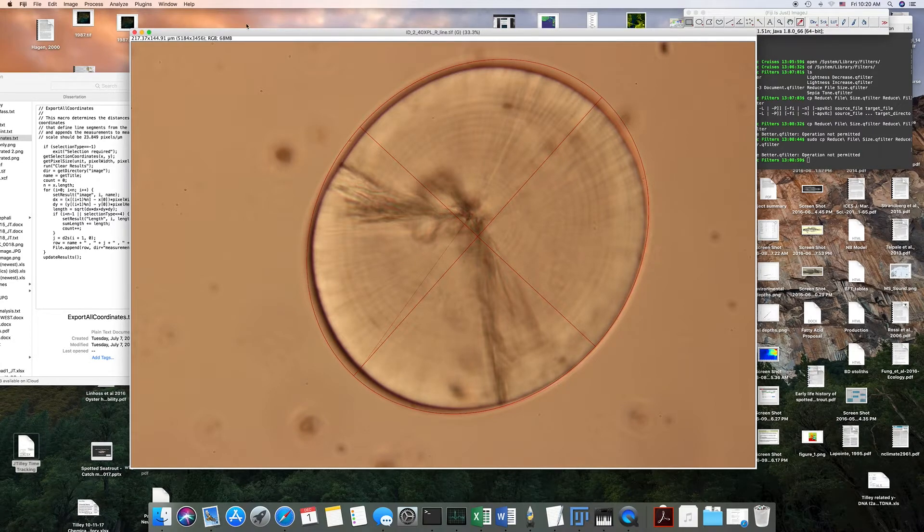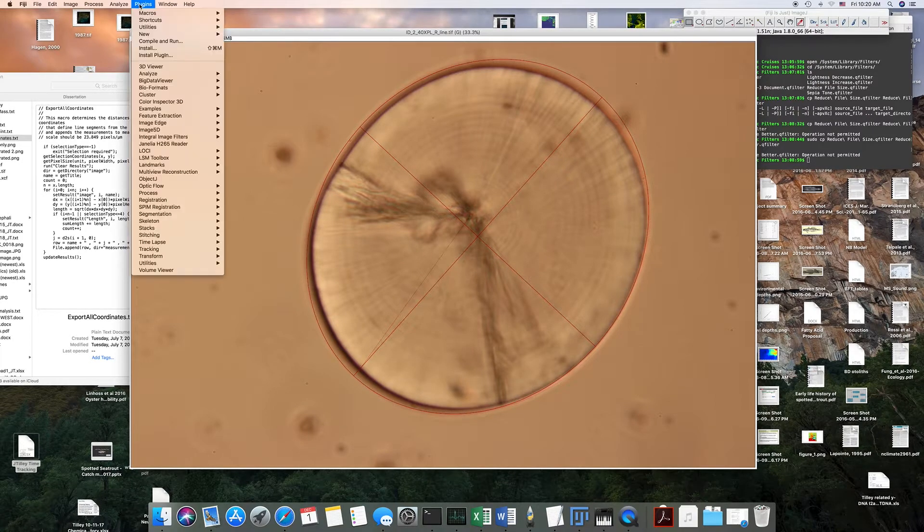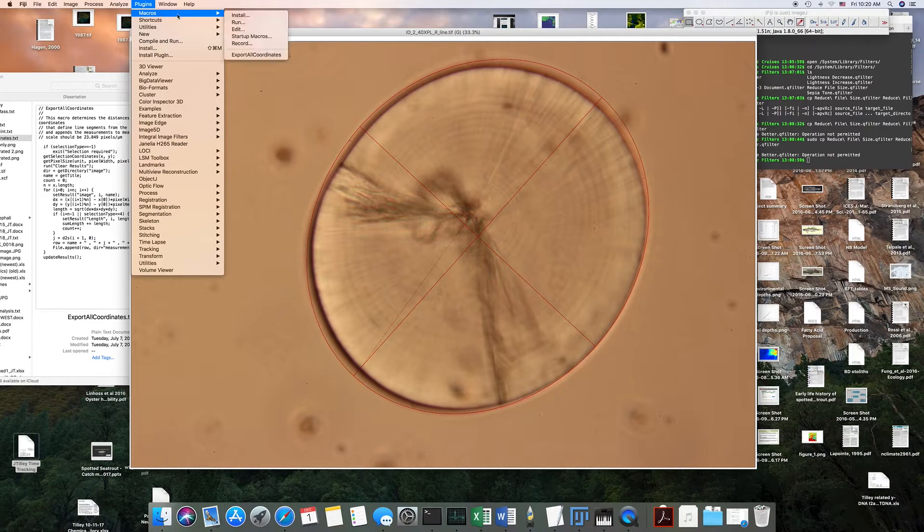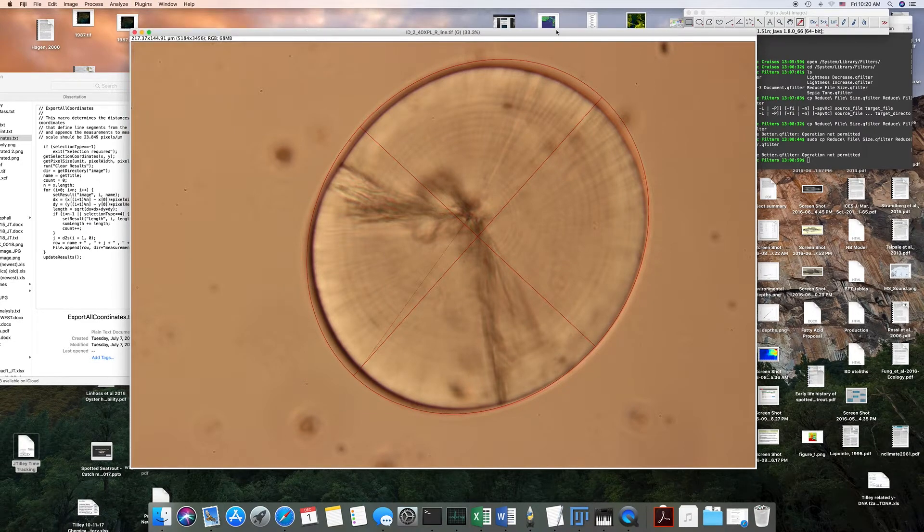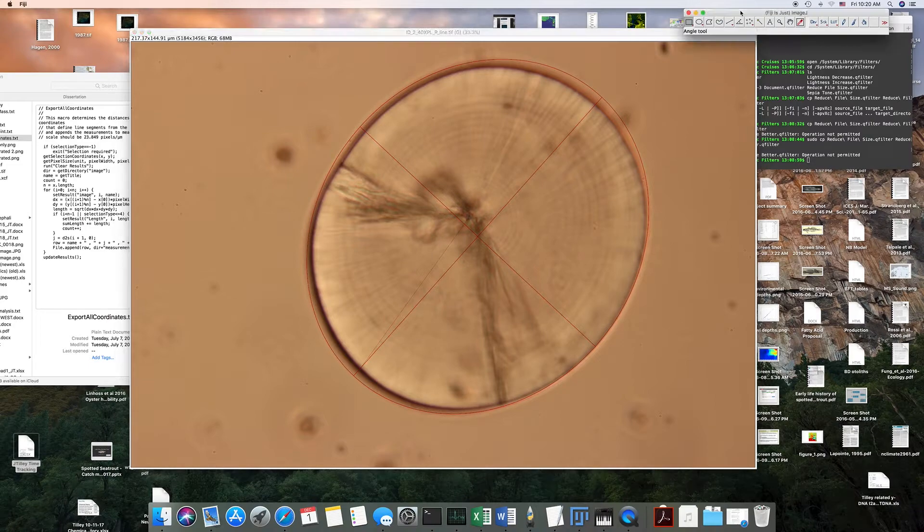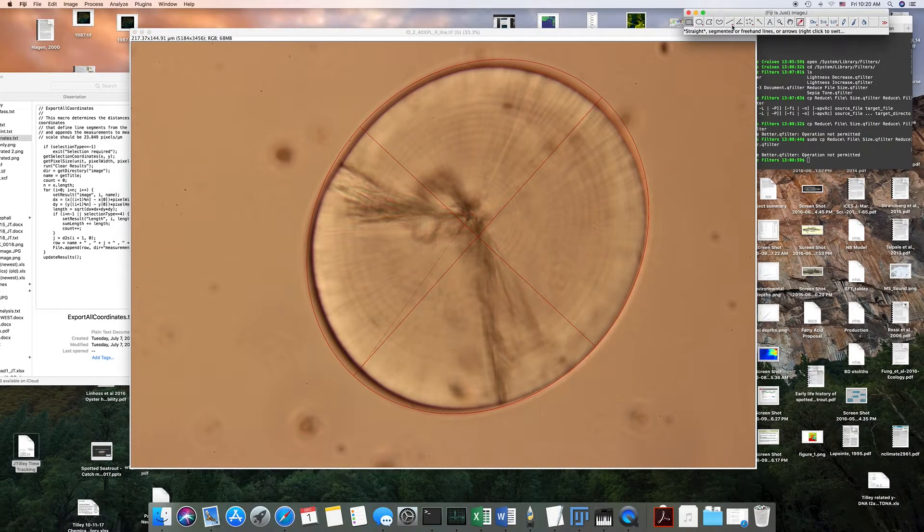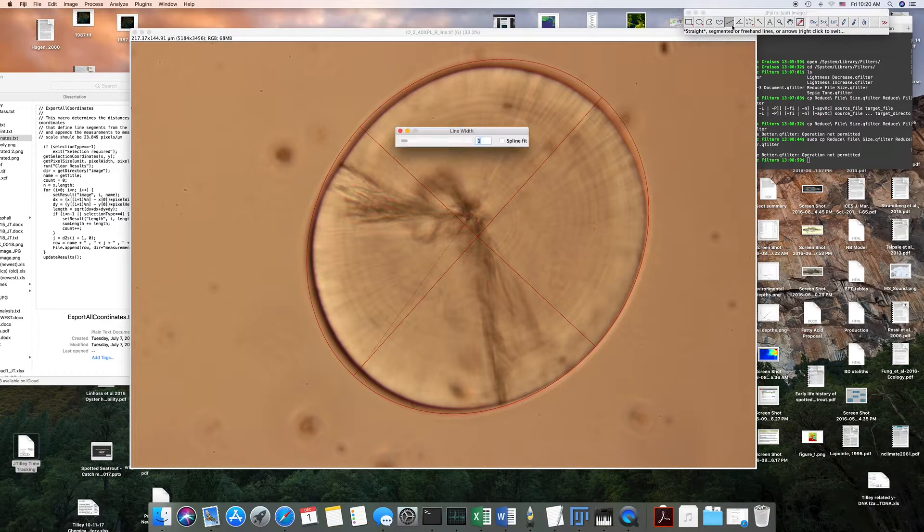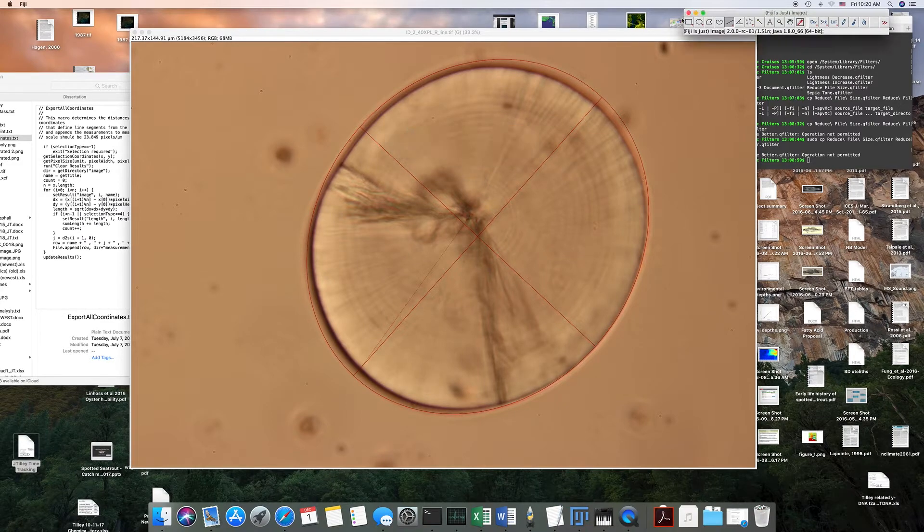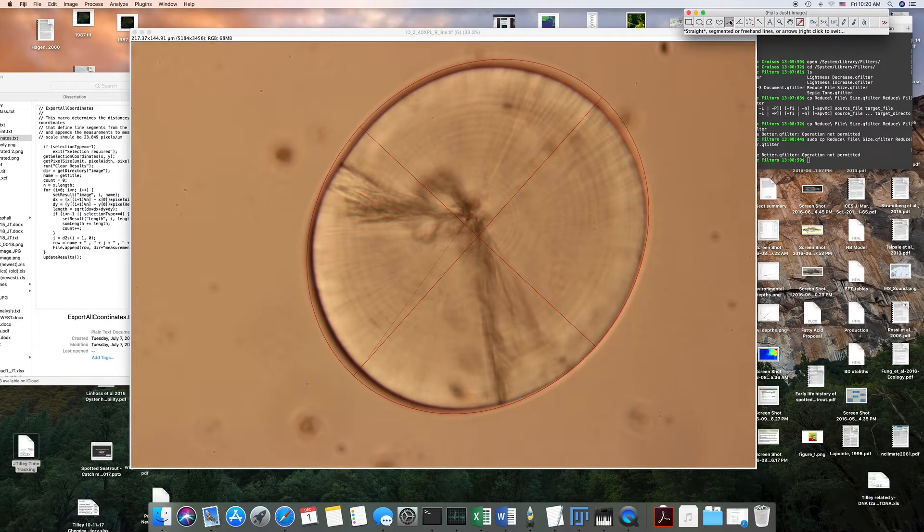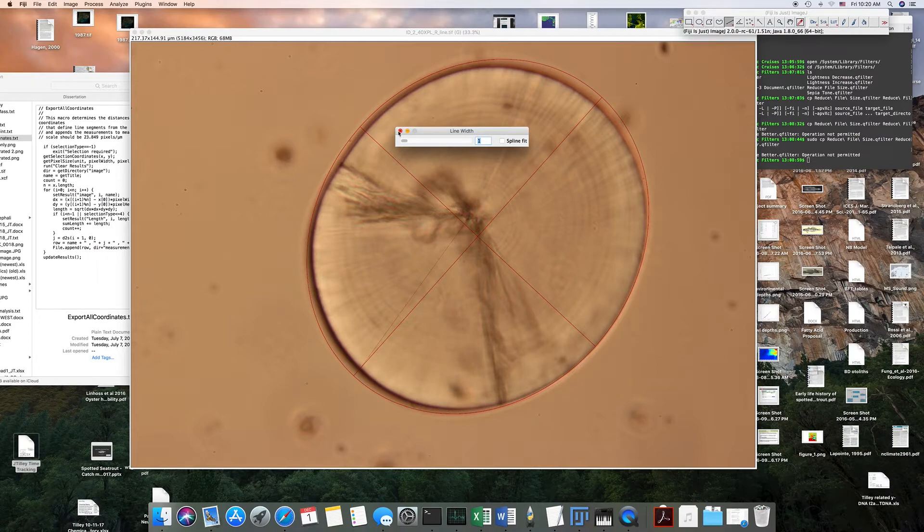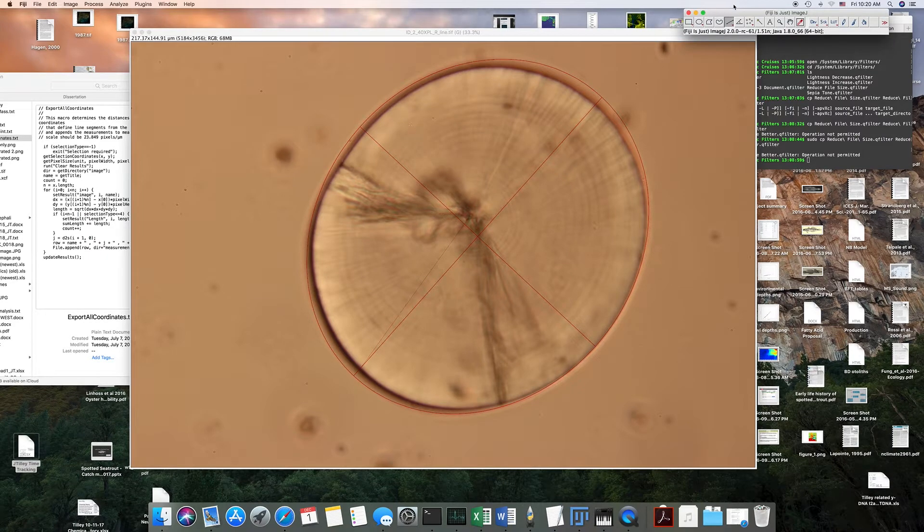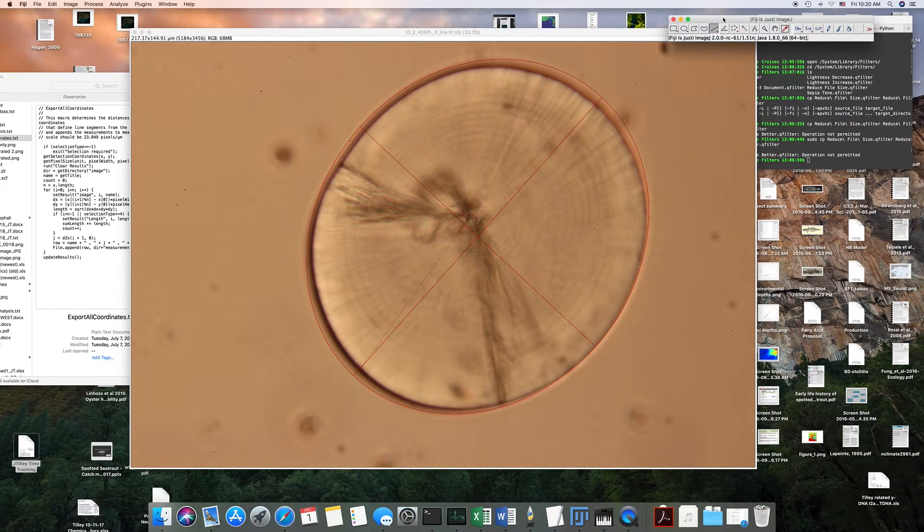So the next step, since we've got our macro installed, is you're going to come up here and then you're going to click on this line right here. It should give you an option to do a multi-line.